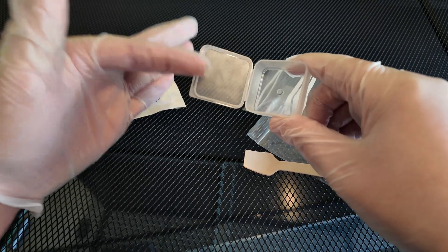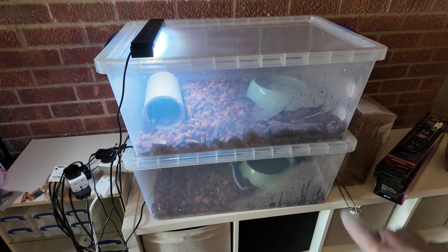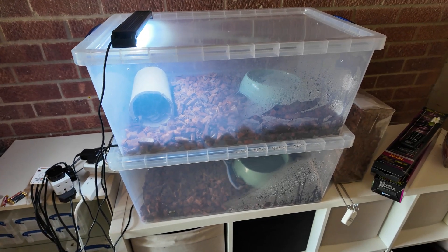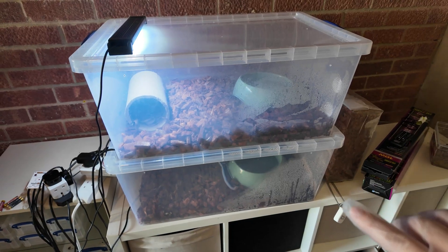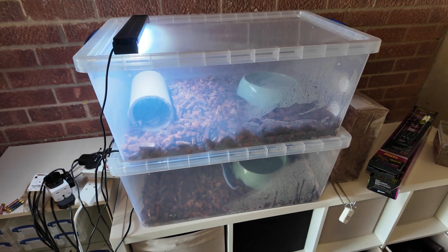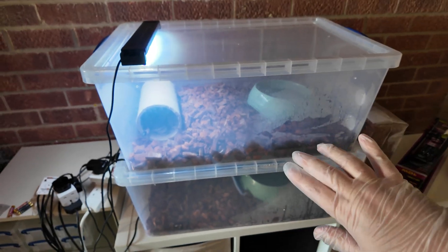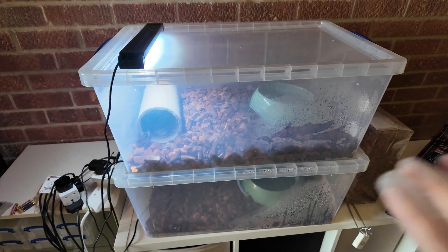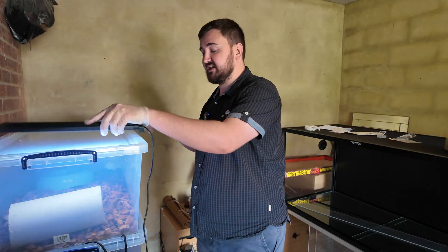I'm going to put feces from both snakes in one sample. The reason is these two have been paired together and bred together for multiple years — if one has got anything the other likely has it too. I'm essentially viewing them as one entity in terms of what their parasite burden likely will or won't be.